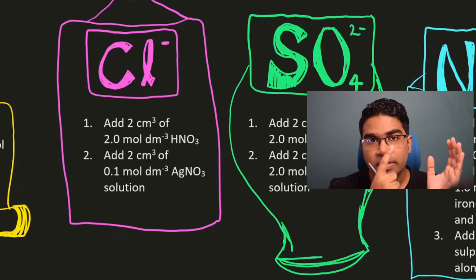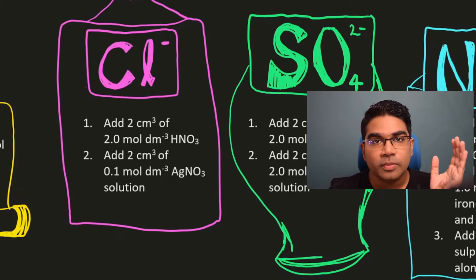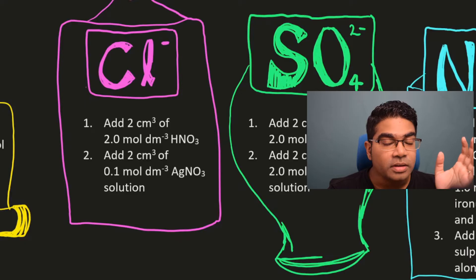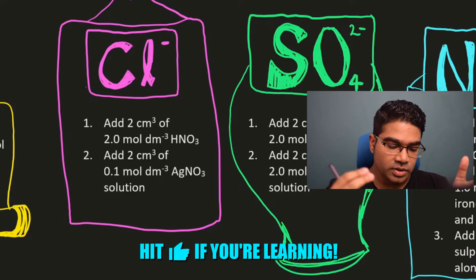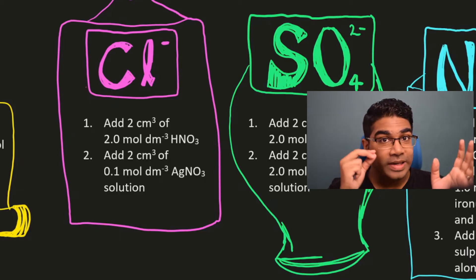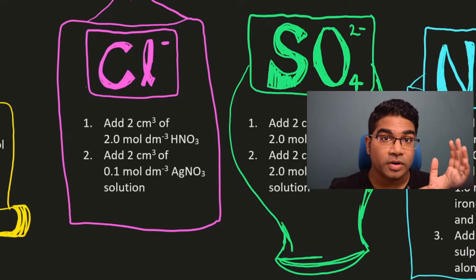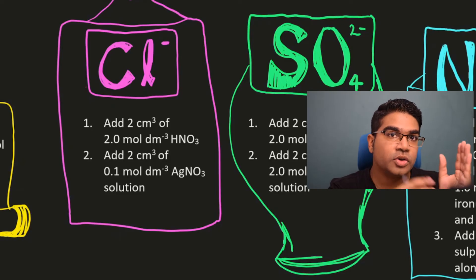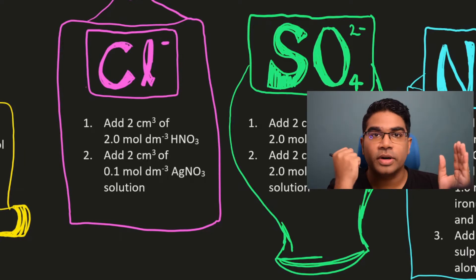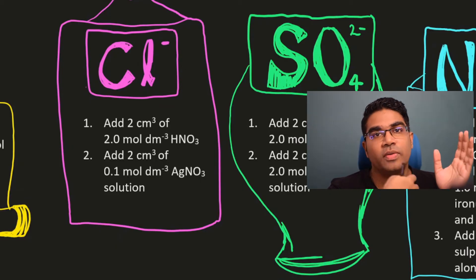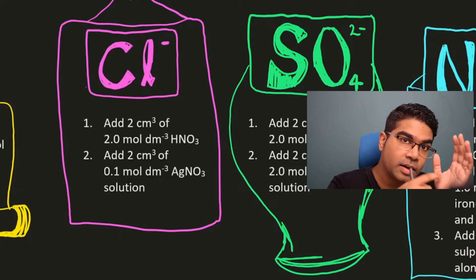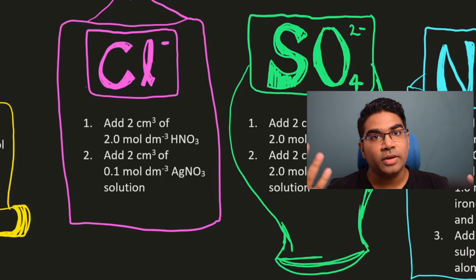Let's look at the chloride test. In order to eliminate the false positive due to the presence of carbonate ions, the first step is to add some acid. In this case, we are going to add 2 cm³ of 2 mol per dm³ nitric acid. The reason we add nitric acid — of course you could add any acid — is because we want the anion present to be the same as in the reagent. We are using silver nitrate, so we use nitric acid. We cannot use hydrochloric acid because that will create a false positive — you want to test if the test sample has chloride ions, so you cannot add chloride ions into the test sample. The nitric acid is to remove any carbonate ions, because if carbonate ions were present, the nitric acid would react with them and carbon dioxide would be produced, removing the carbonate ions so they cannot give us a false positive.